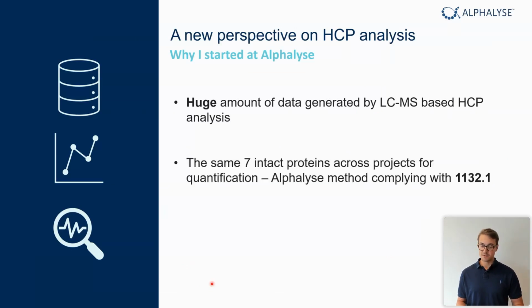All of these samples have been spiked in with the same 7 intact protein standards, according to the method described in 1132.1. Thomas was quite certain and had a vision about being able to use these protein standards to look across all of these samples somehow. And that's kind of where I came in.